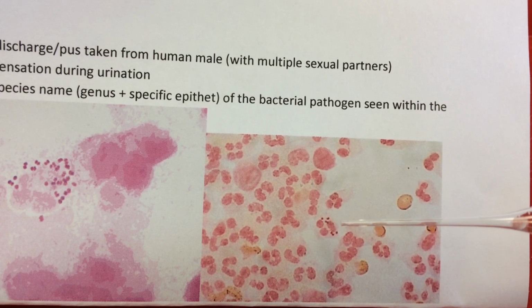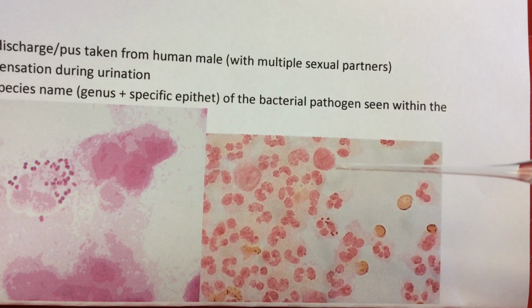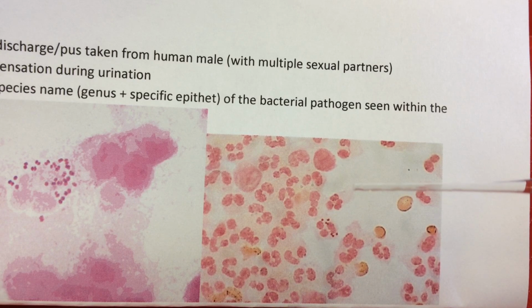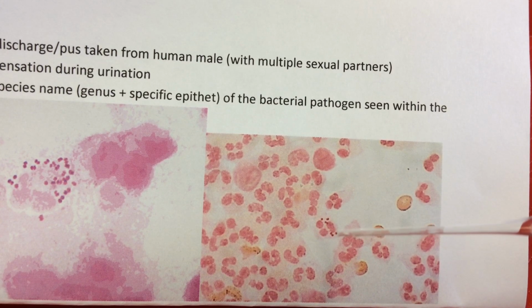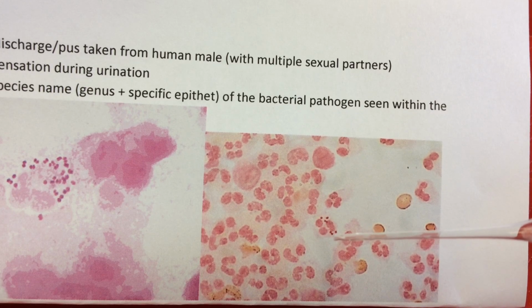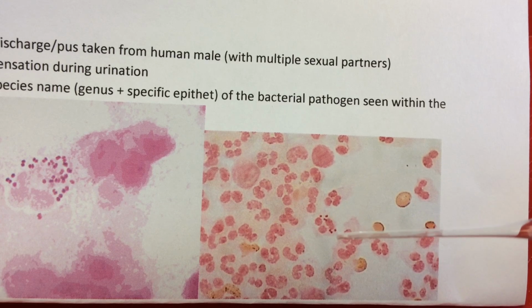So these urethral discharges, they're really lovely. We see examples of human cells, the leukocytes. Human cells, if we were to classify them, they're eukaryotes. They have these nice nuclei here. They belong to domain Eukarya, kingdom Animalia. We belong to the animal kingdom. And again, seeing these lovely animal cells, eukaryotic cells, and in contrast, these much smaller bacterial cells, members of domain Bacteria. They were prokaryotes, they lack a nucleus here.